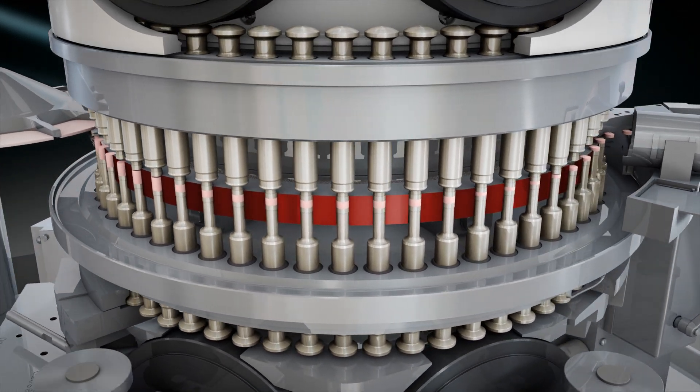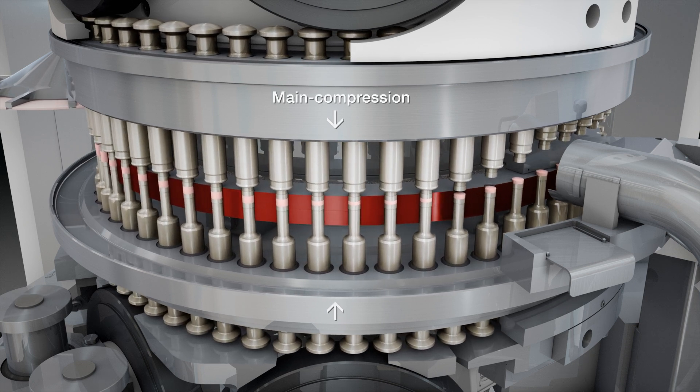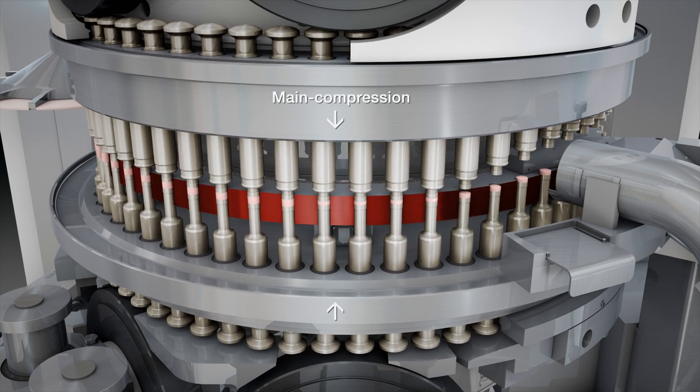At the main compression station, the material is compressed to the final tablet specifications of form, thickness, and hardness.